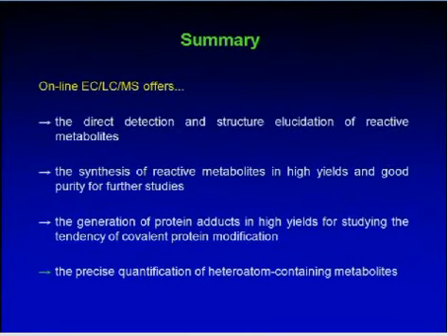Well, the problem simply is that ICP-MS, if you look at the plasma, in the plasma you get an ionization of the compounds by the loss of one electron, which means you get the cation. And that means that all the elements which are more electronegative will hardly be ionized. And especially fluorine is very hard to ionize. There are just very few papers, for example, from the group of Gary Heaftje quite a while ago, where they looked at the ionization of elements like fluorine.